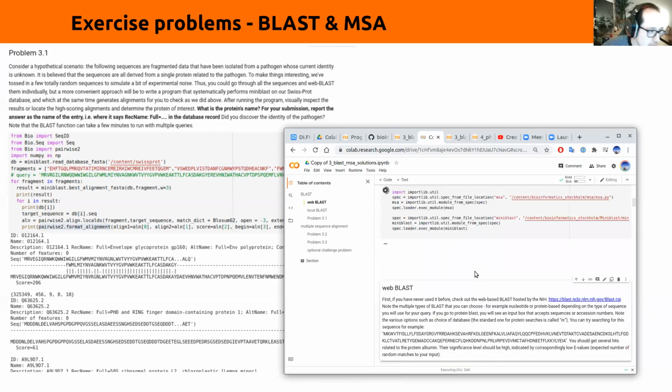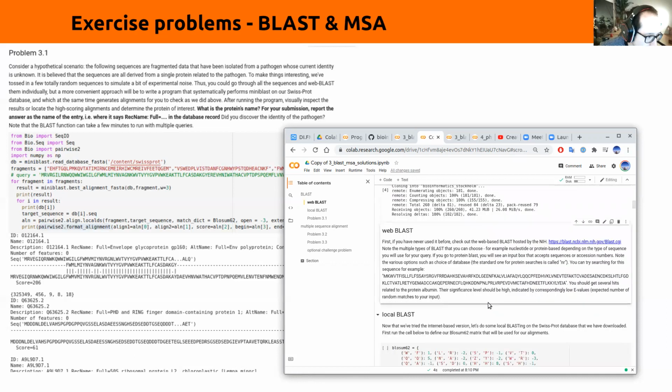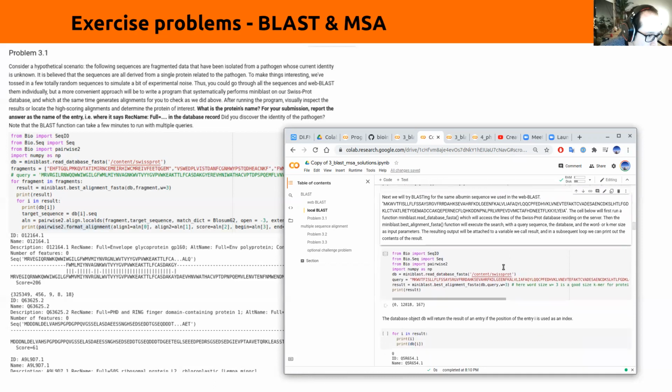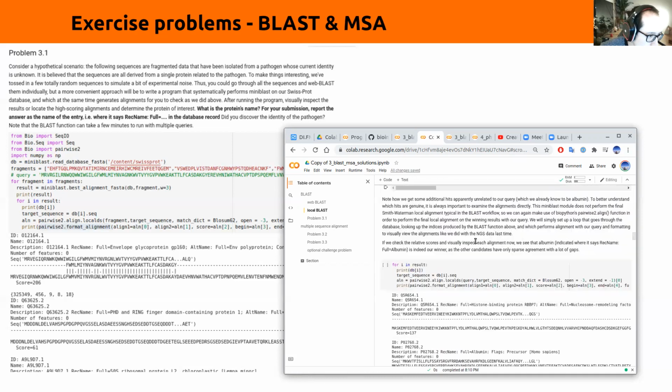And we're importing some homemade libraries that are partly based on the book by Rocha and Ferreira. And we have a Blosum table. And that is everything we need.